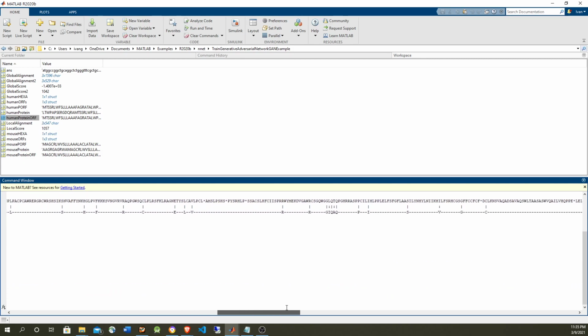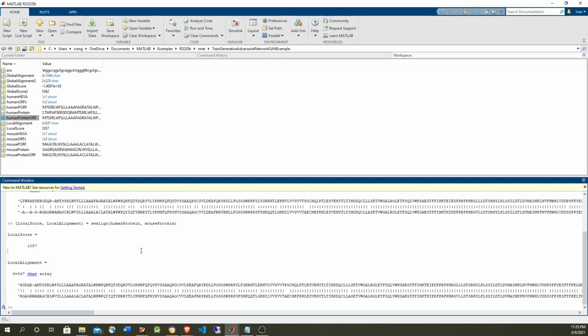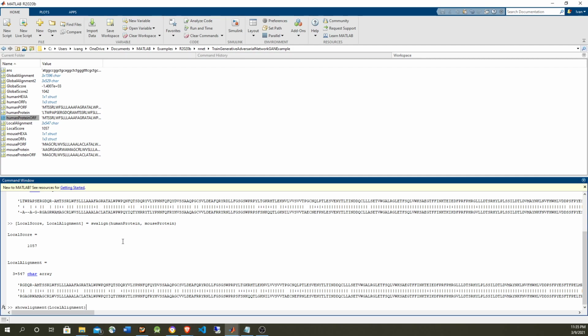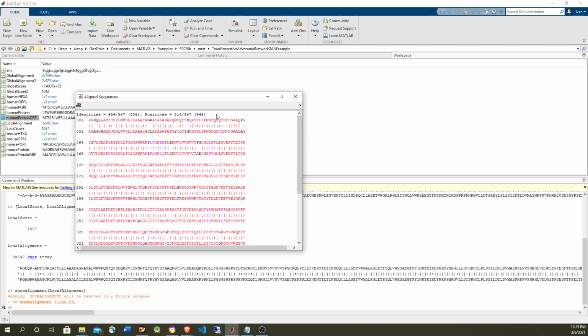You can see that we don't have this huge mismatch. It found automatically, so we didn't have to get into the trouble of trimming either the DNA or the protein. It just found automatically the highest match. So it looks like this might be the best strategy offered for alignment. Now let's take a look at how well it fared. Again, 94%. By doing the nucleotide comparison and then converting to protein, it gave us 95%, so that gave us a little bit better.